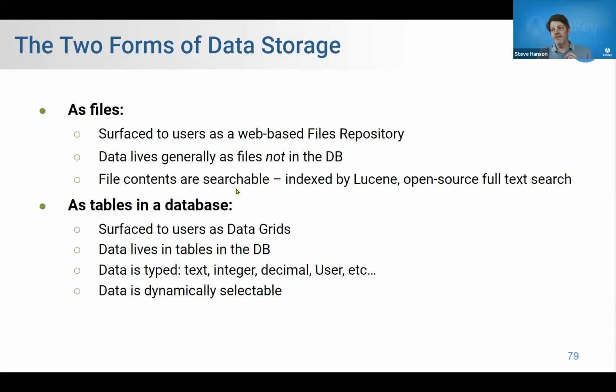These files do not live in the DB. They are just on the file system. The file's contents are searchable. As soon as you import the file, it becomes indexed, and you can then apply searches to it. So that's files.